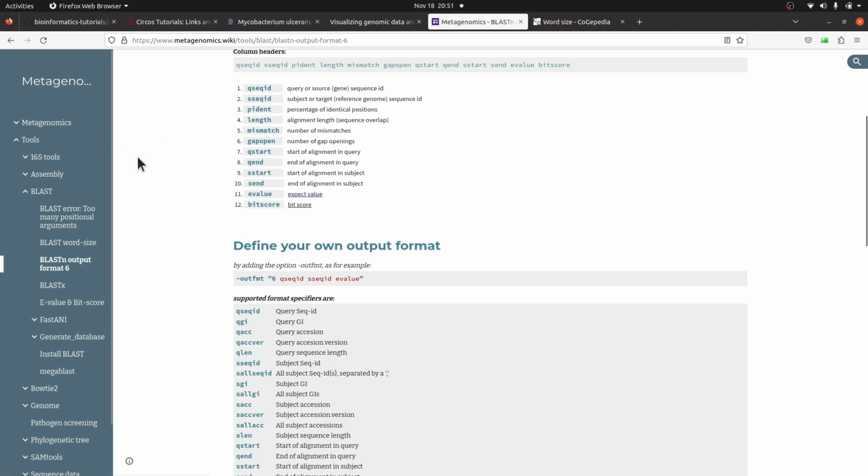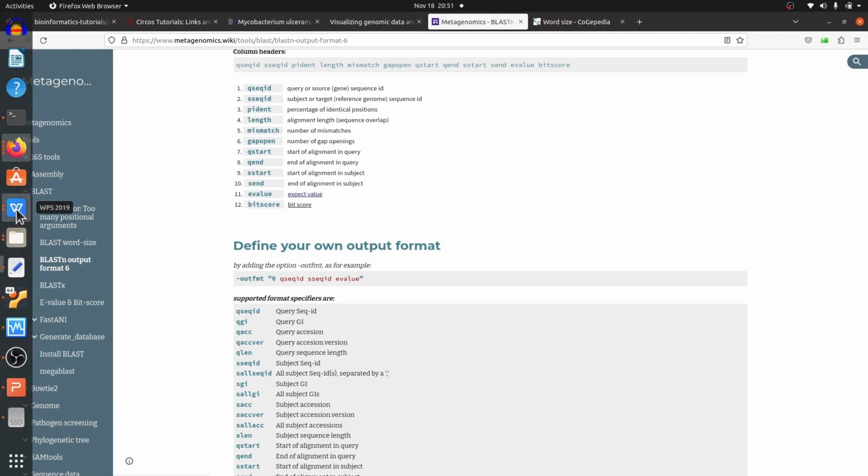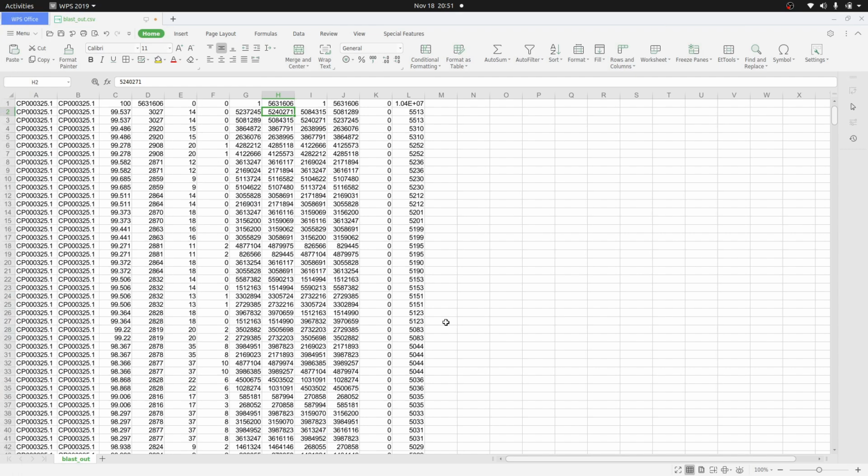So we are looking at regions where there are repeats. Basically, what this tells us is that this region and this region, from this position to this position, the sequence there is the same as the sequence in this position, this and then this. That's what you should take from this particular tool right here. So this and this, the sequence here is the same as this and this. So this is a repeat. The same applies to this and this, this and this. They are the same, so it's also a repeat.